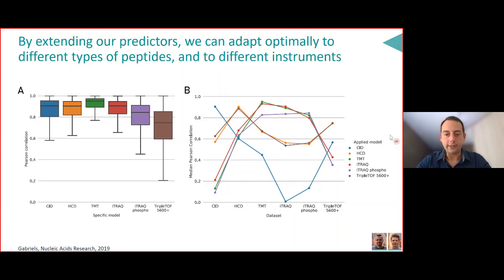Yeah, so we haven't done that direct comparison because we don't have the commercial tool in-house. However, I can tell you that the Kuster group, together with people in the US, with Brian Searle, have done a very, very similar thing. And when we actually compared the results that they got versus the results that we got, they're extremely similar, despite the fact that the algorithms being used are very different. And so this is what I said earlier on.